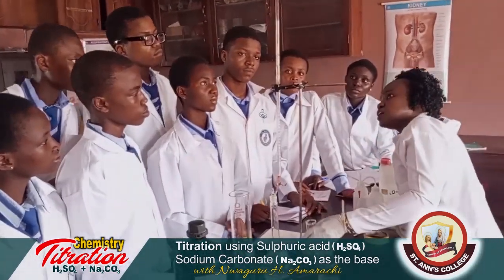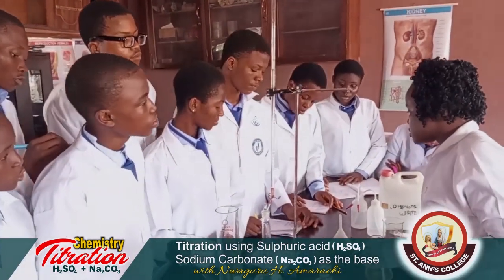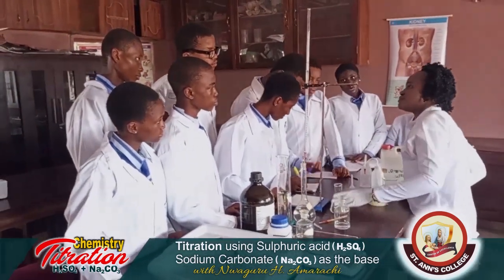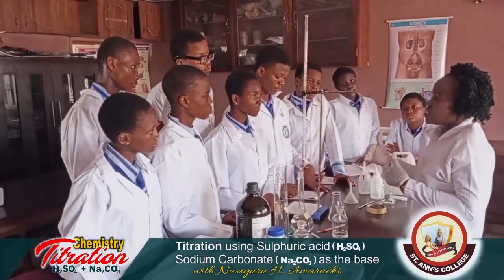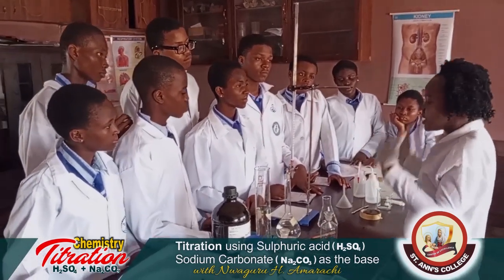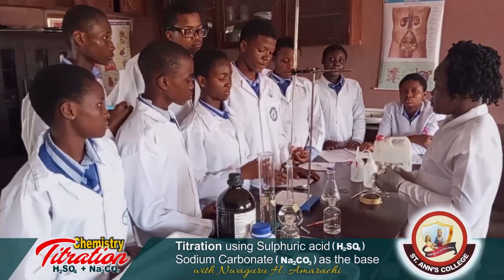The value is 18.50, and the previous one is 24.20, a very far value. That means our neutralization should be between 18 and 20. So let's go for the third titration, to have a clear endpoint.